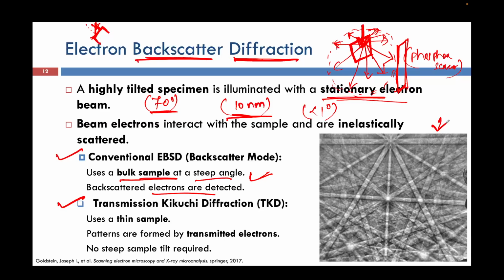From this kind of pattern we will be able to extract information regarding phase, crystallographic orientation, and interplanar spacing. We will also be able to extract the orientation relationships.